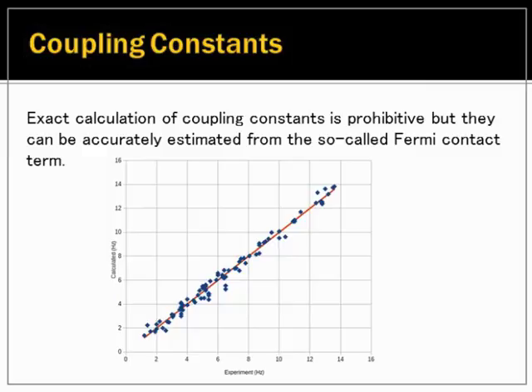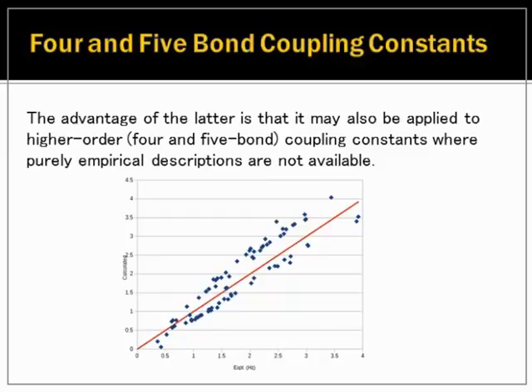However, what the empirical Karplus calculation is doing is really 3-bond coupling. There is no equivalent for longer range coupling empirically. There's no conspicuous relationship. We and others have played with this. But once you calculate a coupling constant, you get everything. And so here is higher order 4 and 5 bond coupling. There are not that many really good experimental data that are easily extracted, but when you do extract it, you actually get small numbers. These are less than a few hertz, so they're a third of the range of 3 bond coupling.